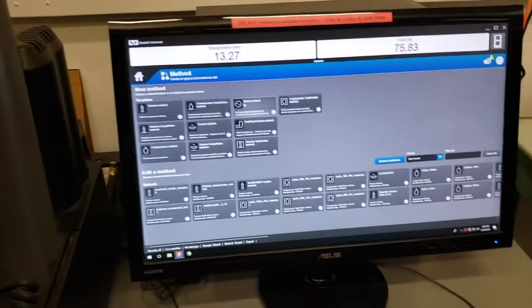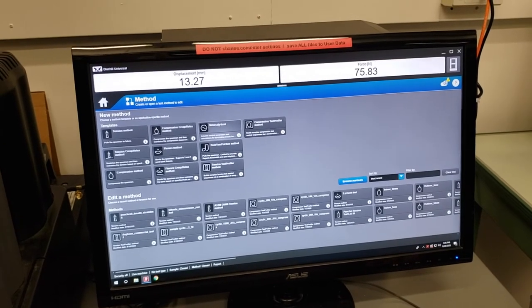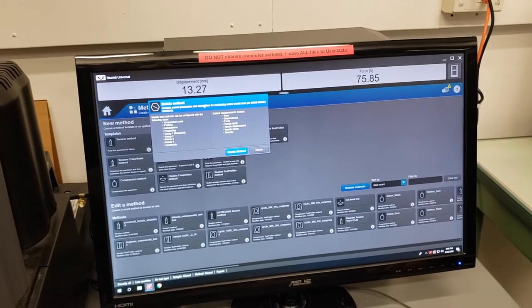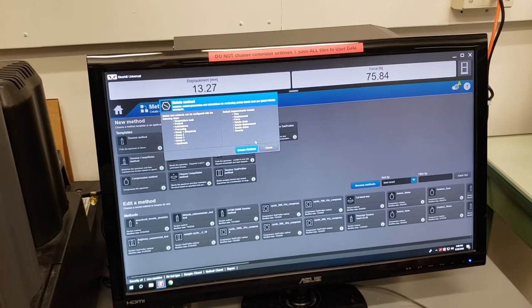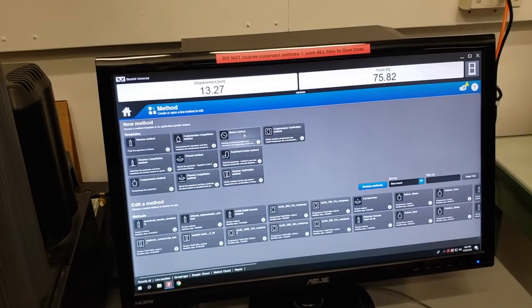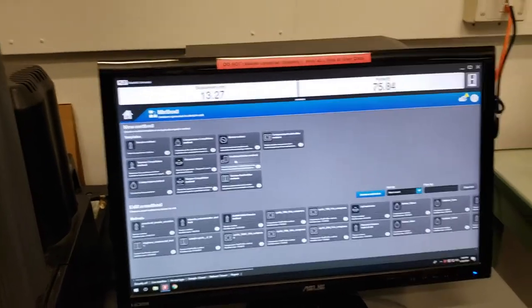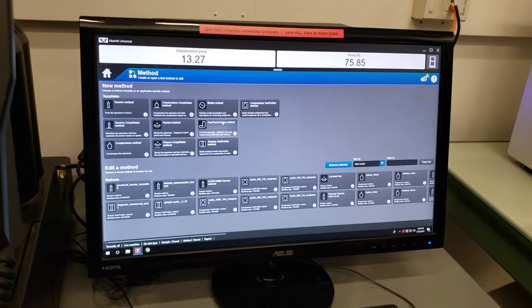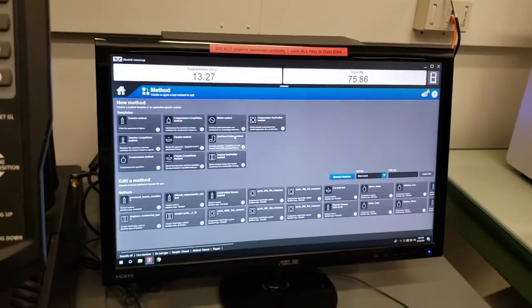In metals method, this is related to a couple of ASTMs specific to testing metals. If you click the little eye in the corner, it tells you it includes control parameters and calculations for conducting metals tensile testing for global industry standards. Peel, tear, and friction tests are similar to a tension method going upward, giving you options for different equations and calculations depending on whether you're doing peel, tear, or friction. We don't have a friction setup in the lab, but peel and tear tests are done fairly frequently.